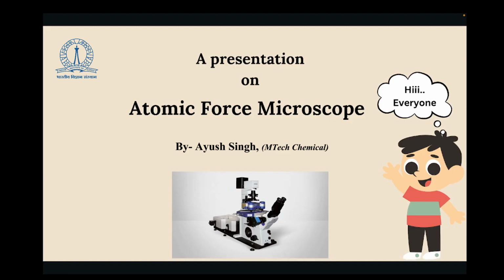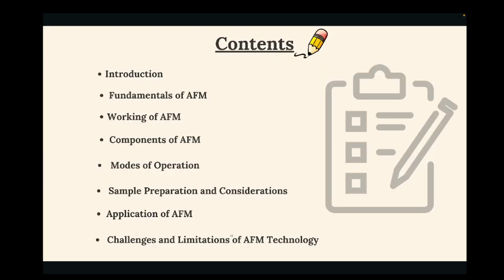Hello everyone. I am going to present a topic on the atomic force microscope. These are the contents I am going to cover in the upcoming slides.